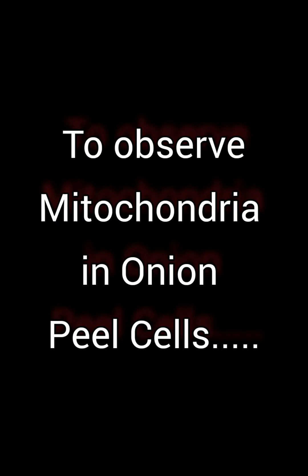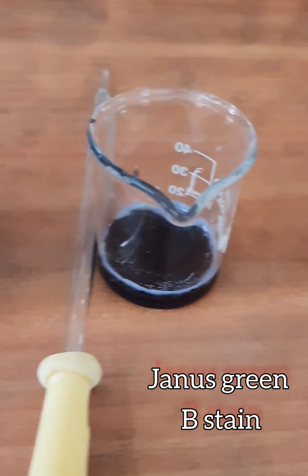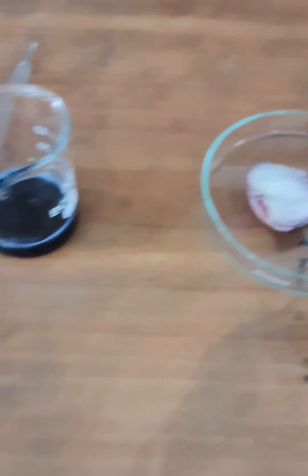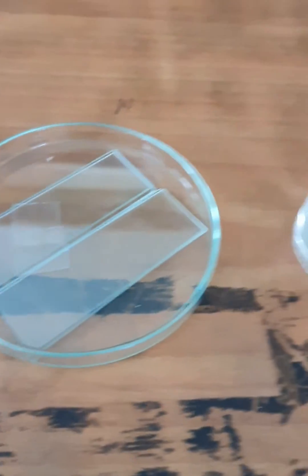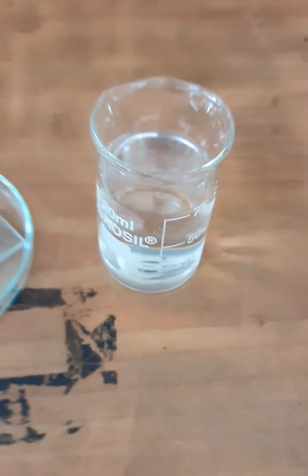Hello students, today we are studying to observe mitochondria in onion peel cells. For this we need Janus green B stain, onion, forceps, slides, cover slip, and water.